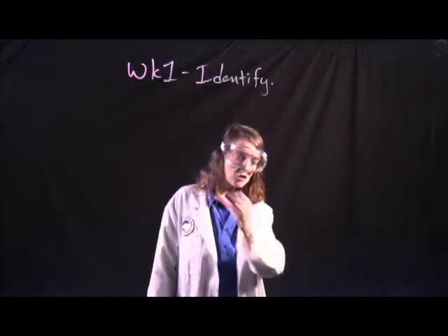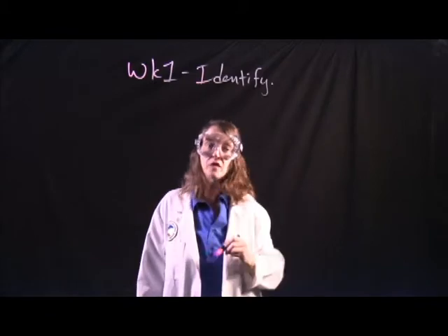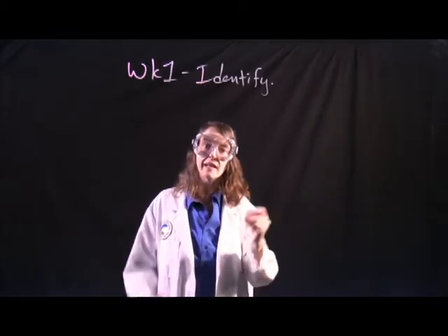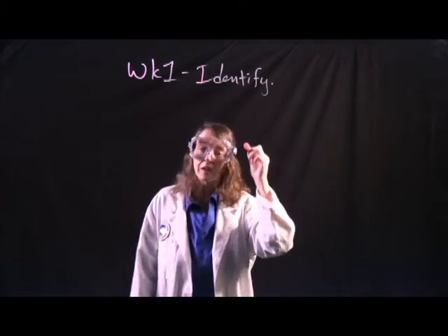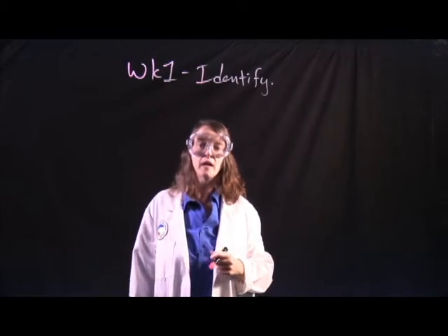What I mean by that is you need to be able to write the chemical formula for this compound after you've done the experiments. So look for the experiments that are written in this procedure that will allow you to determine what that chemical formula will be.